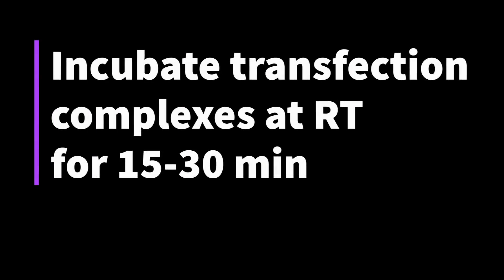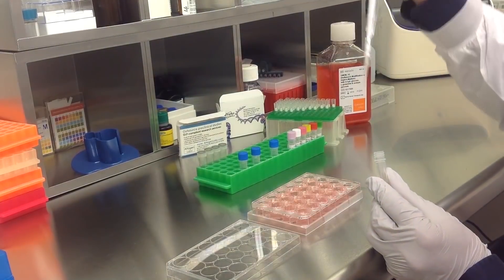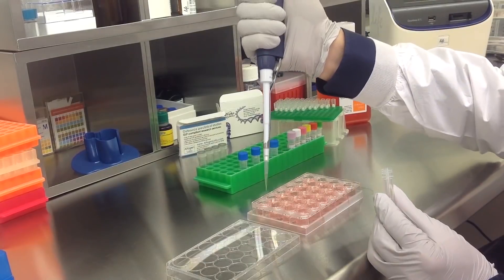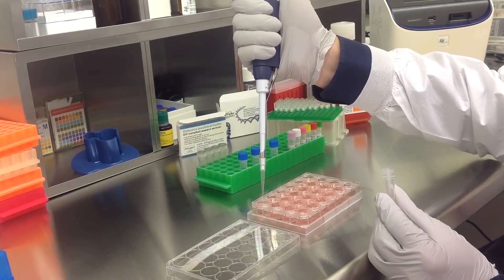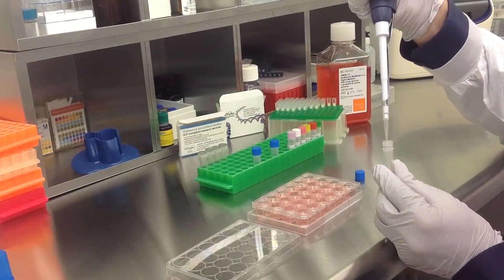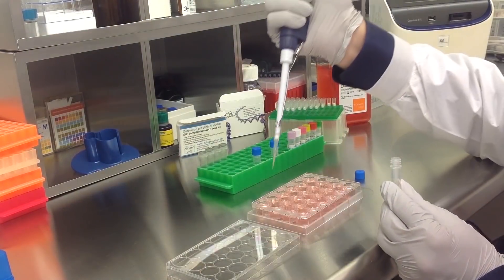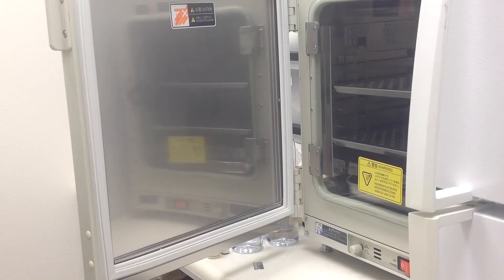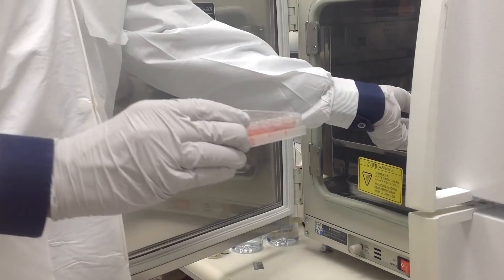Incubate the prepared transfection complexes at room temperature for 15-30 minutes. Add the prepared transfection complexes to the 500 microliters of complete growth medium. Once you have treated all appropriate samples, incubate the cells at 37 degrees Celsius in a humidified carbon dioxide incubator.